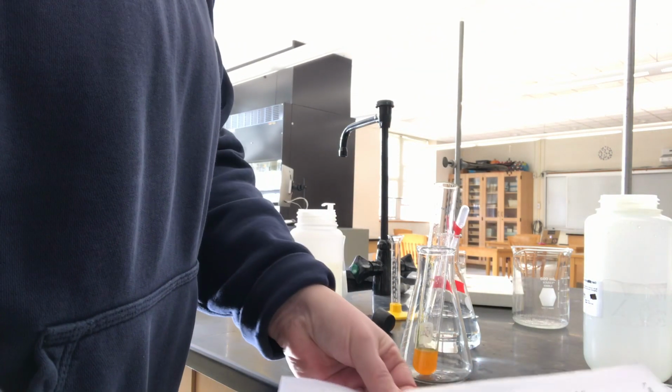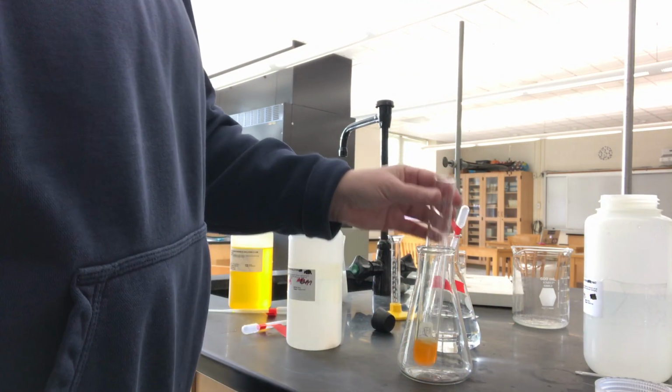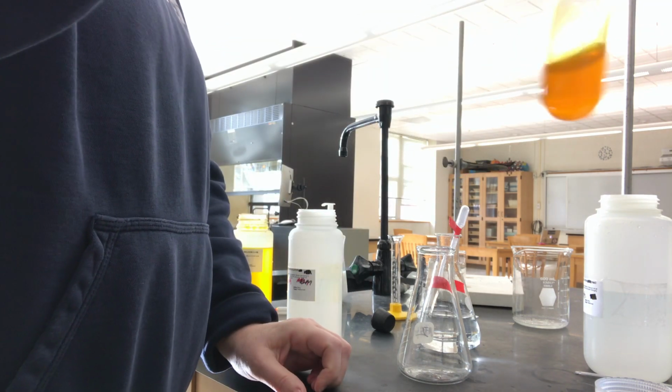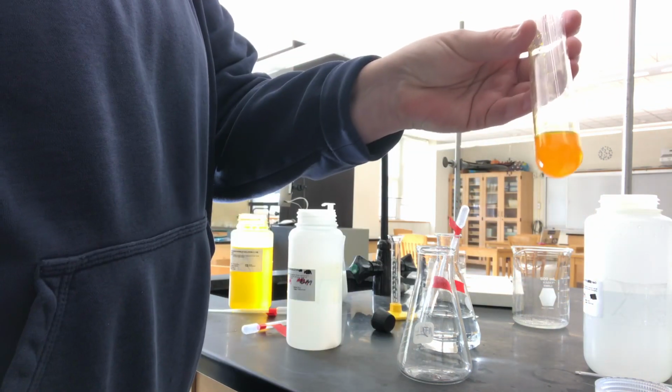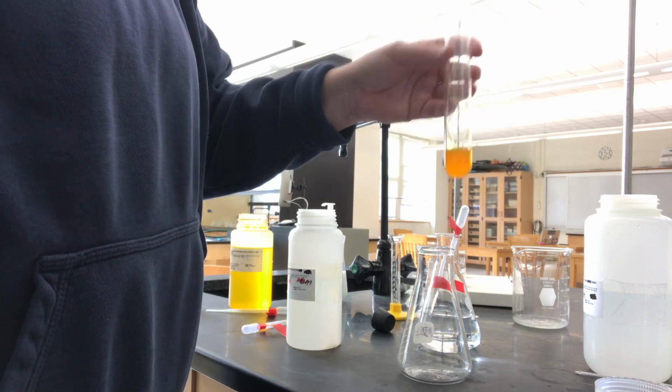When you try to answer this one, it's going to help you to go back to part D, the chromate dichromate ion equilibrium, and you're going to see similar things there. So our yellowish precipitate became an orange solution, and it really doesn't look like there's any precipitate left there at all. Okay, and that's it.